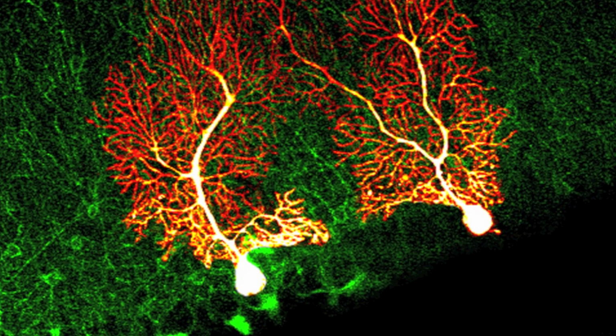So we took a slice of the cerebellum like that, and when you magnify that a little bit, you're going to see folds like this. If I take a small part of one folium, what I'm going to see is three layers. In the middle layer, there are what are known as Purkinje cells in an ordered manner, and this is what you see in red in the picture because we fill them using a dye.